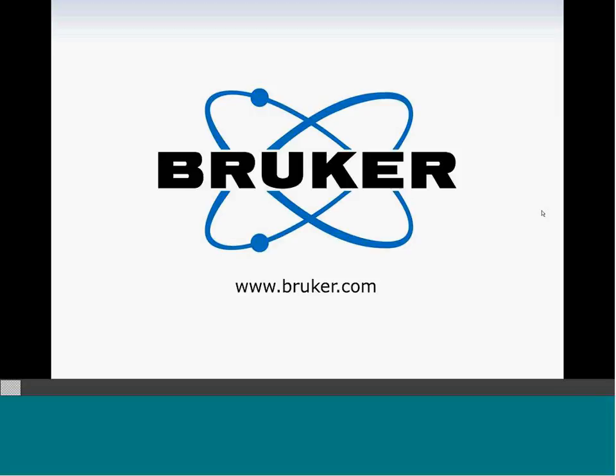Great. I just got another question. Have you done any biological applications with Terra 2, and what would be the dynamic range of the system? Yes, we are doing some biological work, not Bruker itself, but our customers do a lot of biological imaging of tissue. That's a big area of research. We use Terra 2 to help the pathologist figure out where the pathology is.